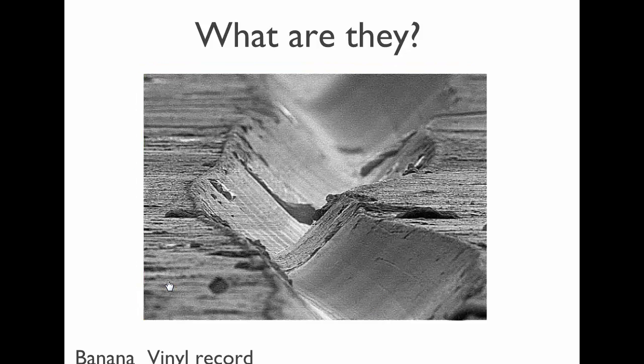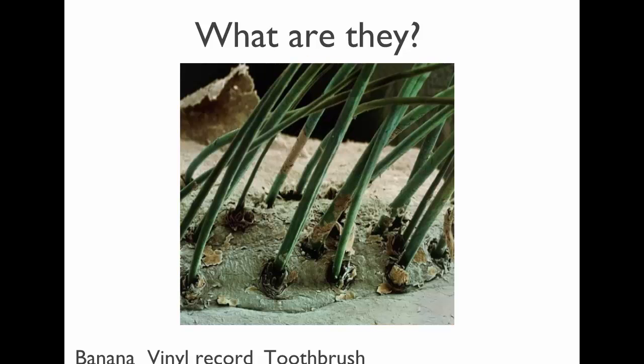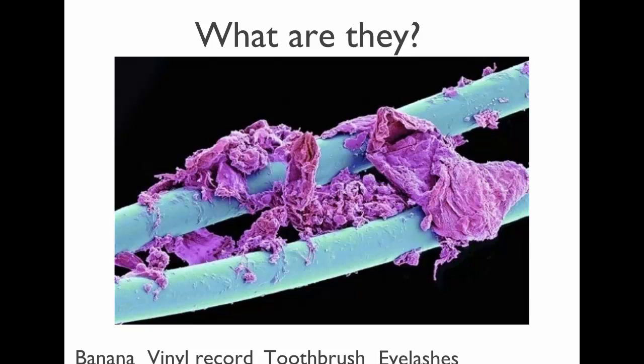Chocolate. A record. A vinyl. Those are the grooves of a vinyl record. That's a toothbrush. Eyelashes. Somebody's wearing a lot of makeup, I think. Dental floss with tooth gum on it.